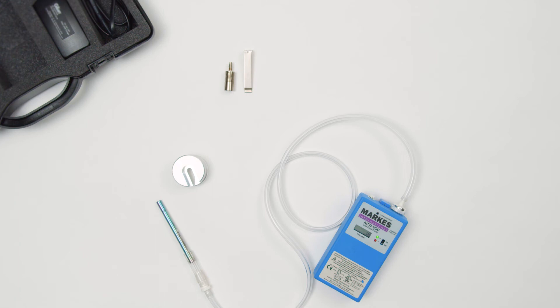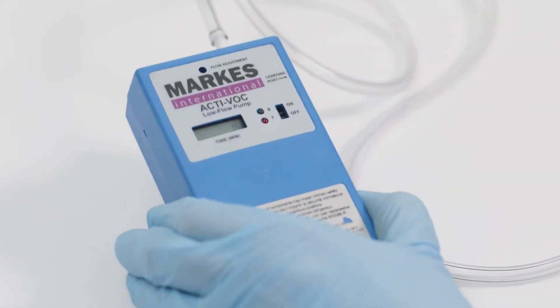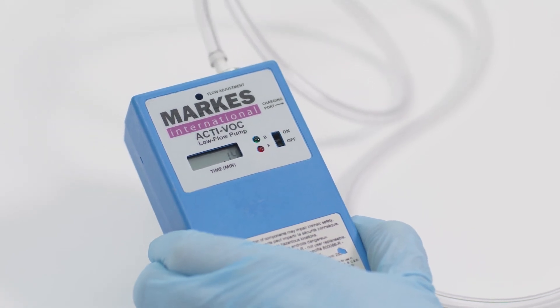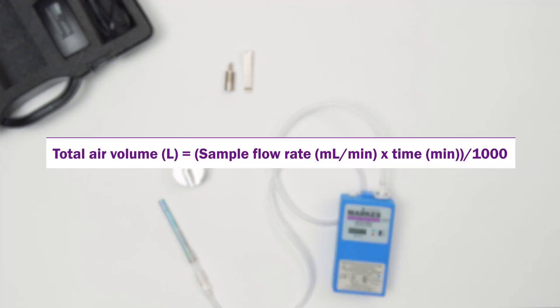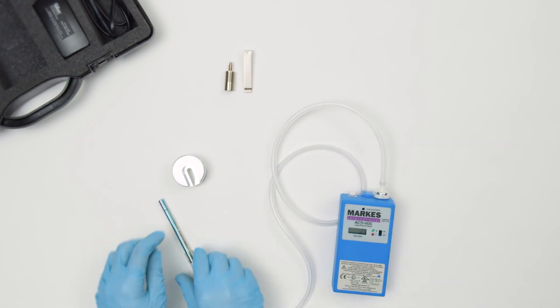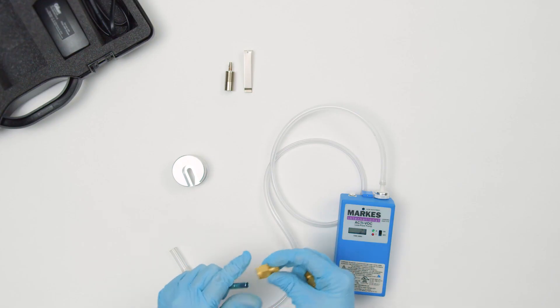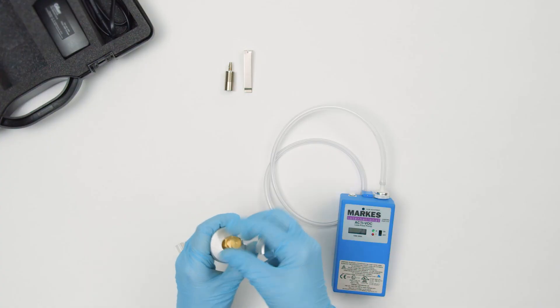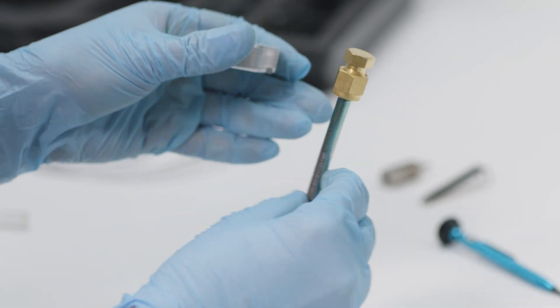After the sampling period has passed, turn off the pump and record the sample time. This is displayed on the ACTIVOC in minutes to the nearest 0.01 minute. Calculate the total air volume. Remove the sorbent tube and seal with long-term storage caps to secure your sample for storage. Your tube is now ready for analysis and your pump can be used for additional samples at the same flow rate.